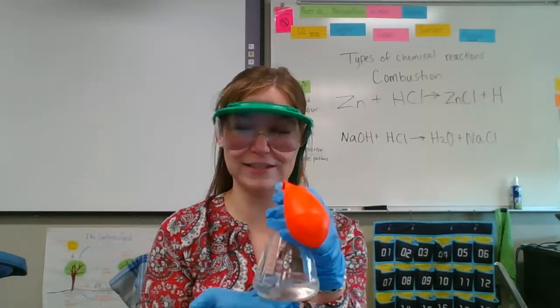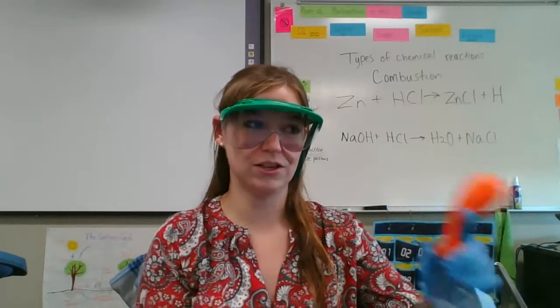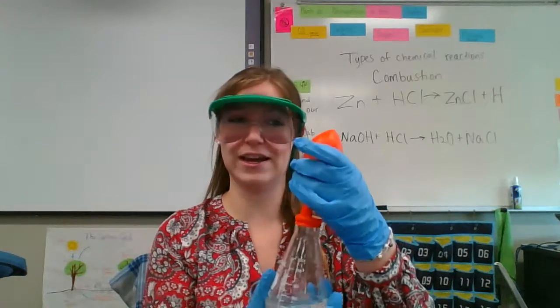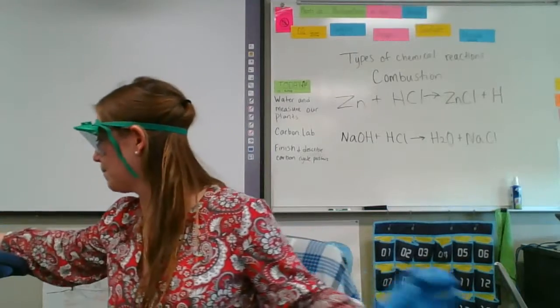And I would have felt the glass get really hot. So unfortunately we didn't see that. Sorry, we'll try again. You can still see some hydrogen gas. So let's do our next one.